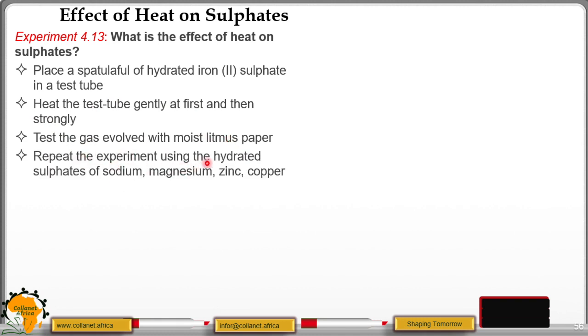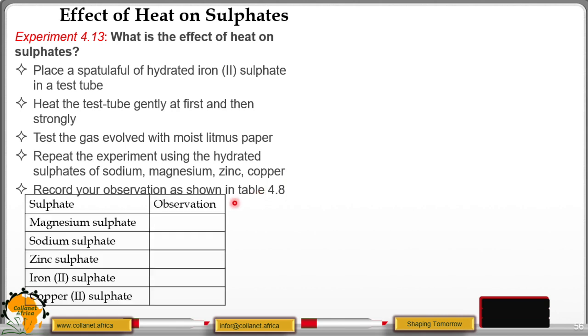Repeat the experiment using the hydrated sulfates of sodium, magnesium, zinc and copper. Record your observation as shown in table 4.8. We have the sulfates and the observations. So you record your observation in this row.